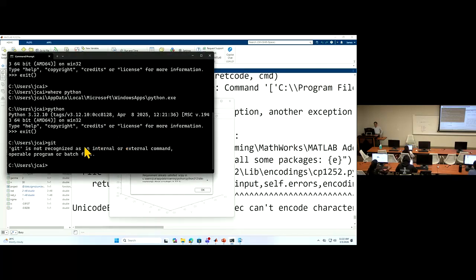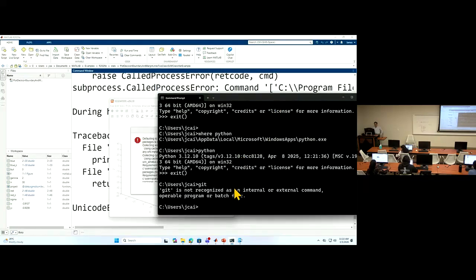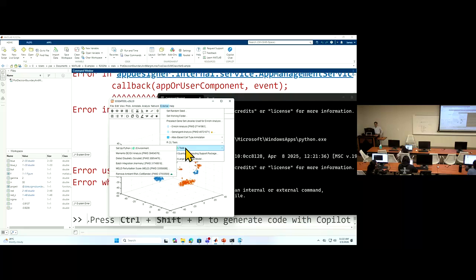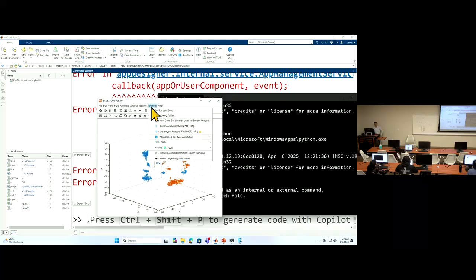Normally what you can do is to install from this Python environment and see whether you can solve the problem. For example, if you had the Python version installed in your Python environment, it should run this.